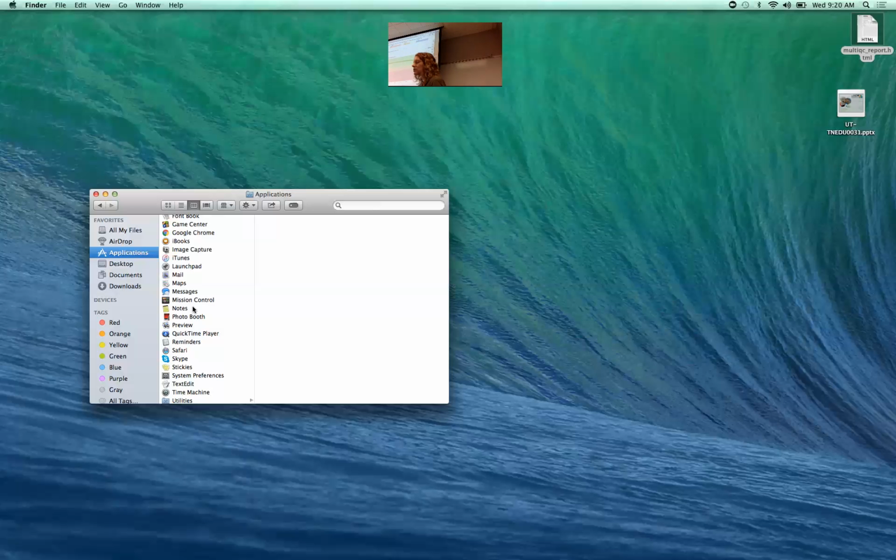But here's where the power really is. If you look at the FastQC files, you would only see a single line for each library, but MultiQC has aggregated these, and you can mouse over and see all of your libraries. And so this is a great sign. Her library quality is super tight. All 32 samples are completely high quality and look really good.